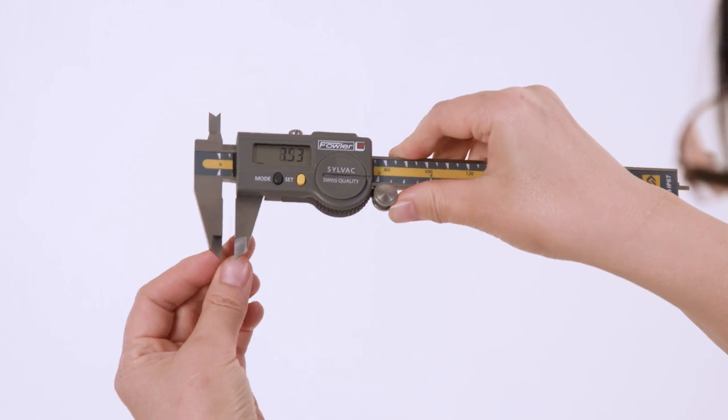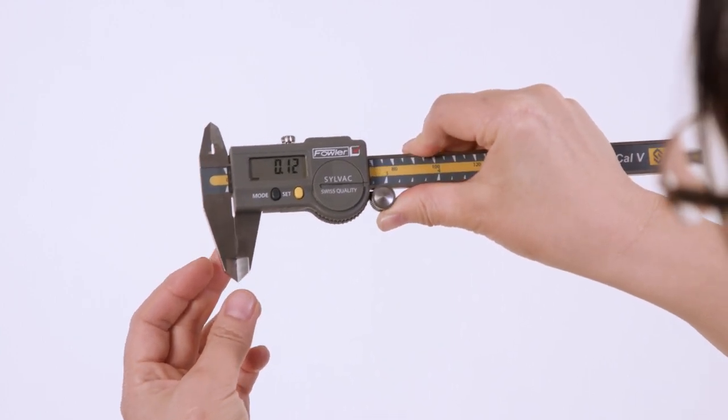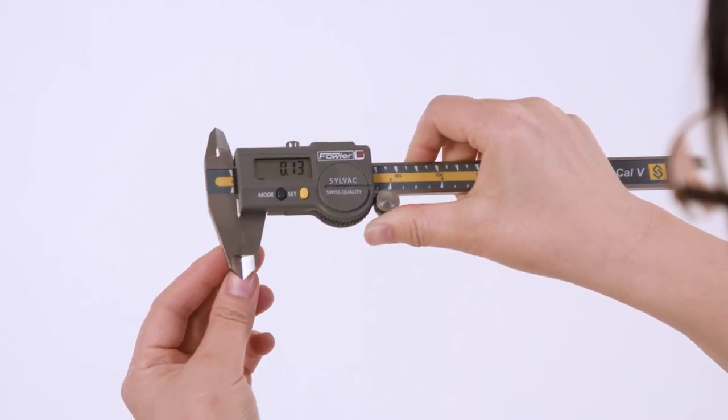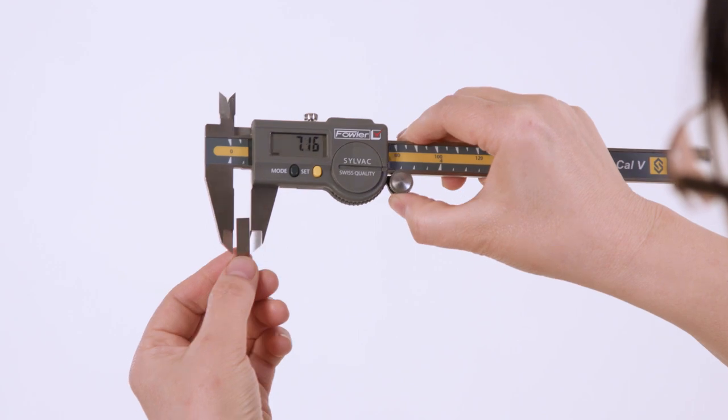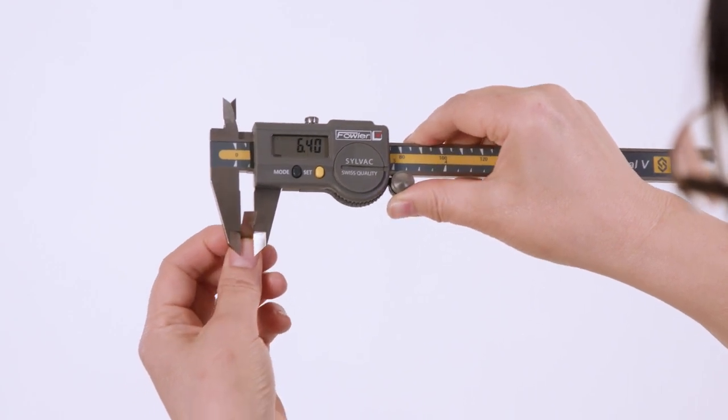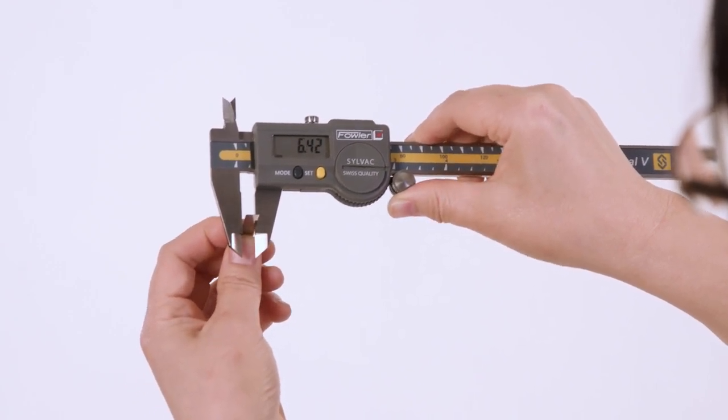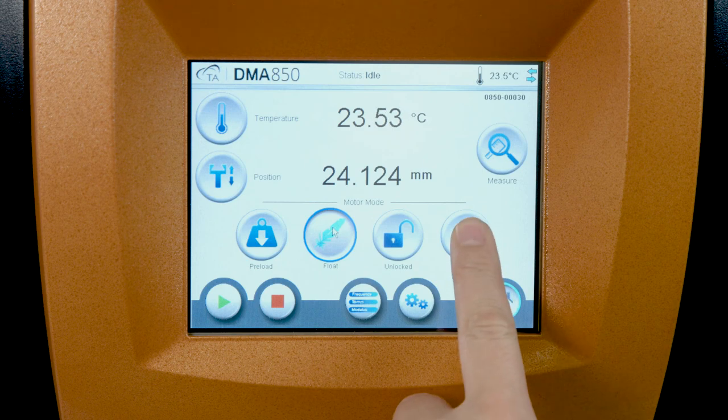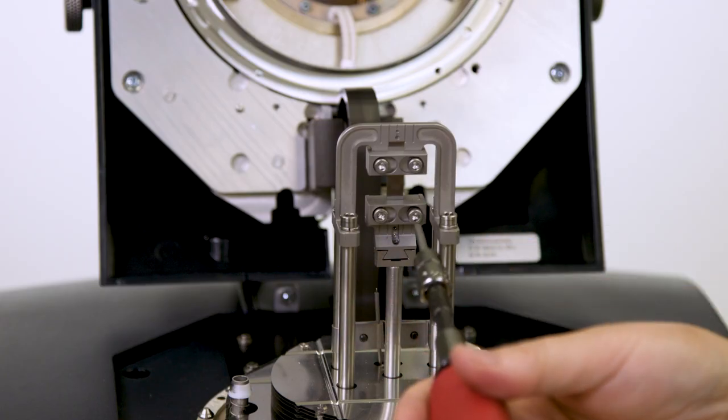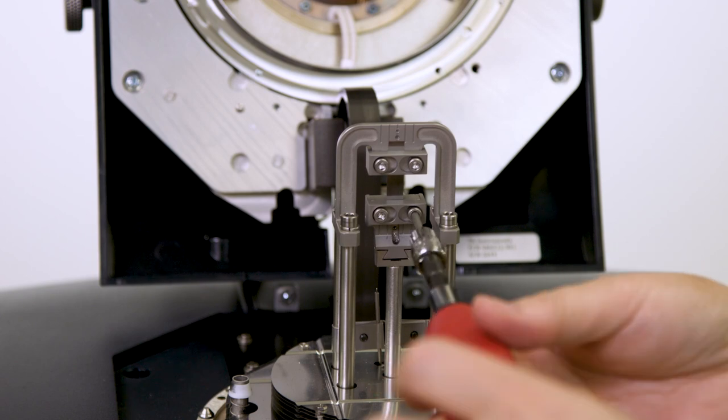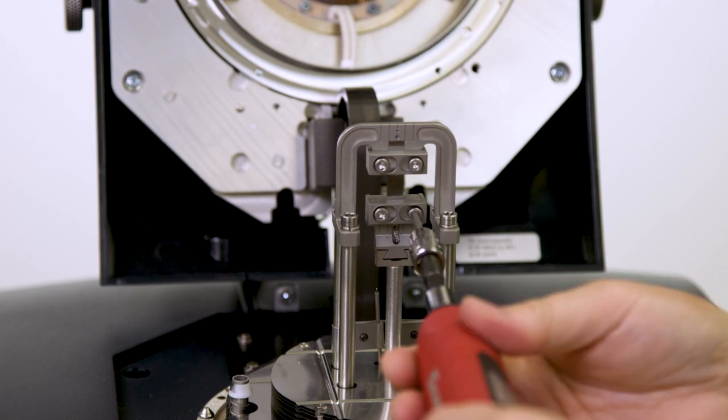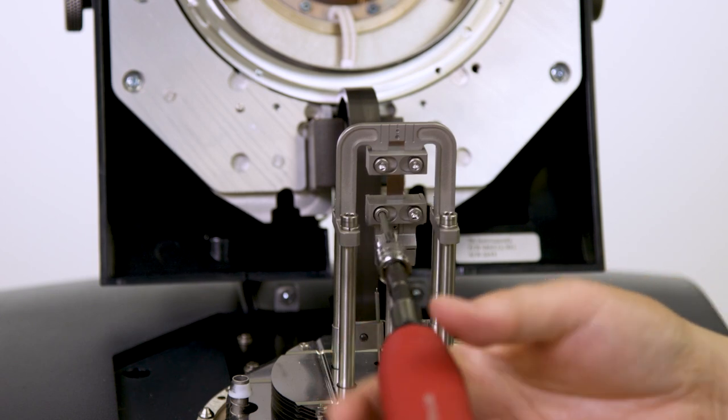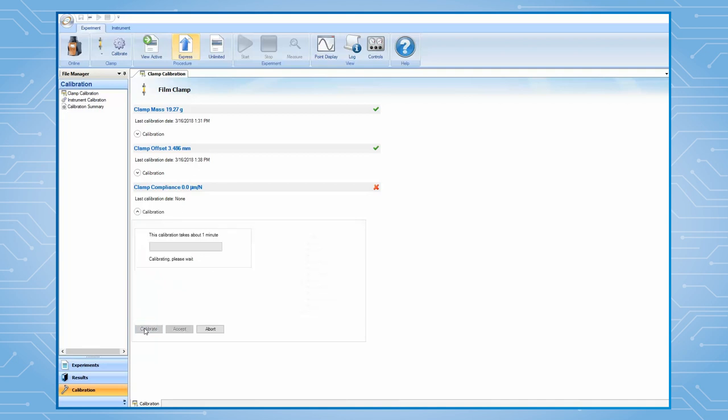The third step is the clamp compliance calibration. Use a caliper to measure the width and thickness of the precision steel compliance sample. From the instrument touch screen, lock the drive shaft. Then, mount this steel sample to the clamp using 3-5 inch pounds torque. Enter the sample dimension to the software and then click on Calibrate to begin the compliance calibration.